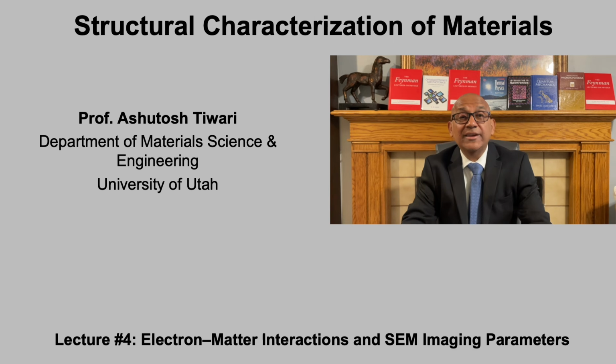Today, we take the next step and ask a more fundamental question. How does electron microscopy actually generate images? To answer this, we will focus on electron-matter interactions, the signals they produce, and how those signals ultimately determine image resolution and image quality, particularly in scanning electron microscopy.